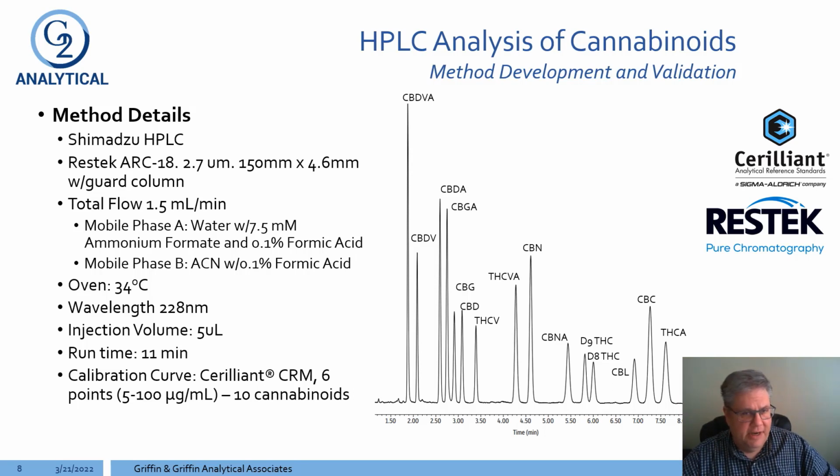Although at this time we still predated any official method of analysis coming from AOAC. So we had to basically look at all of the methods that were out there, select one, fine tune it for our particular application, and then put it through a validation process.